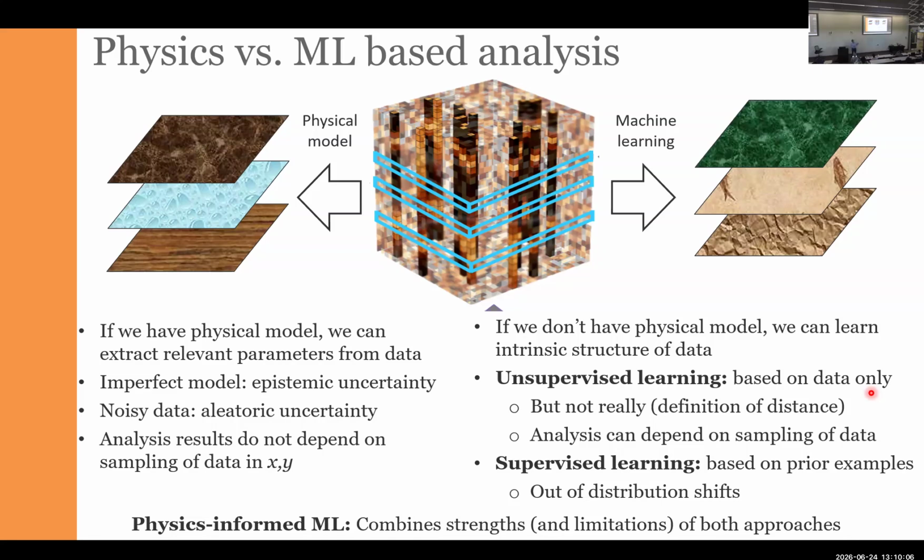If we do the analysis of a data set where the units are electron volts or, vice versa, wavelengths, the results of the analysis can be subtly different. In most cases, the difference would be minimal, but there are enough cases when it would be tangible. So always think about the format of the data, always think about what your x-axis is, because practically that matters, and any textbook in machine learning will basically not tell you that. That's the difference between physics and ML.